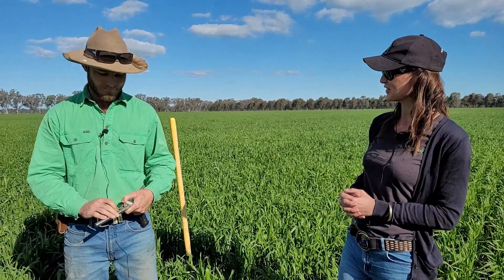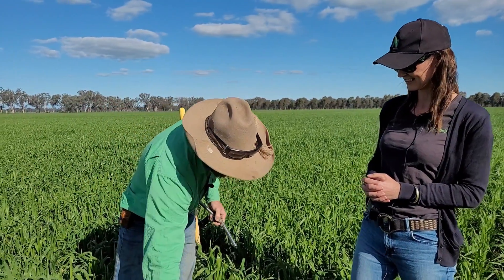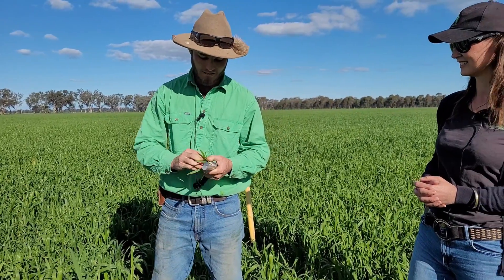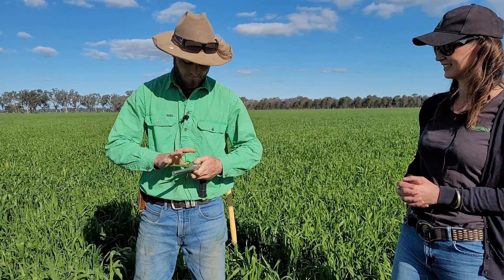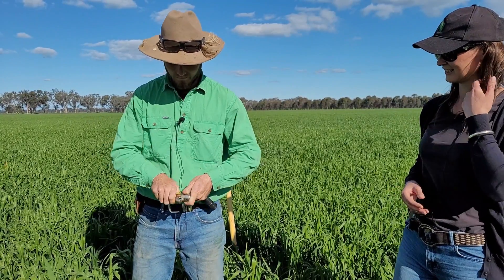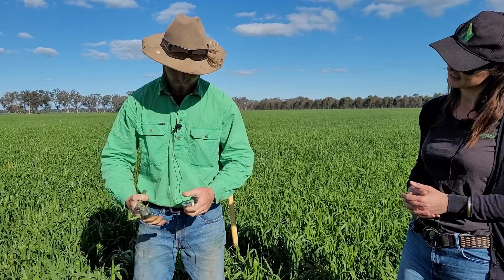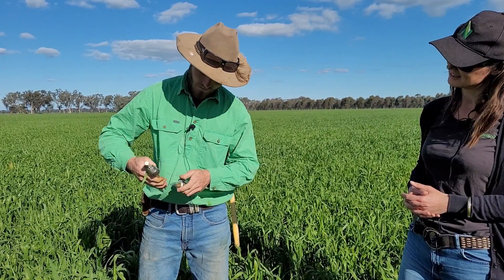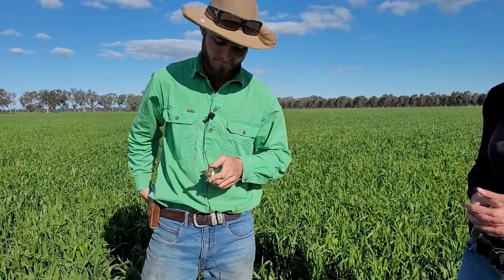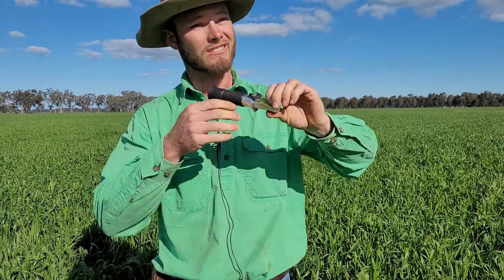So Tom, give us a whirl. Pretty simple process. We'll just grab a bit of leaf material, stick it into the garlic press, squeeze some juice out onto the screen, and then have a look through towards the sun.